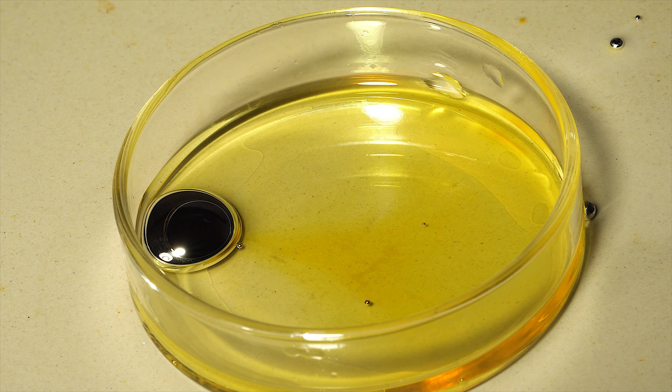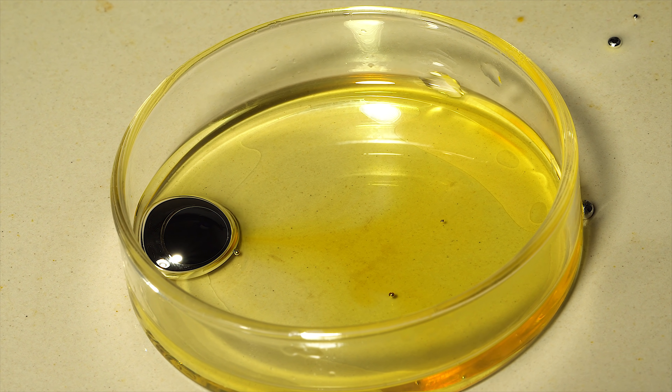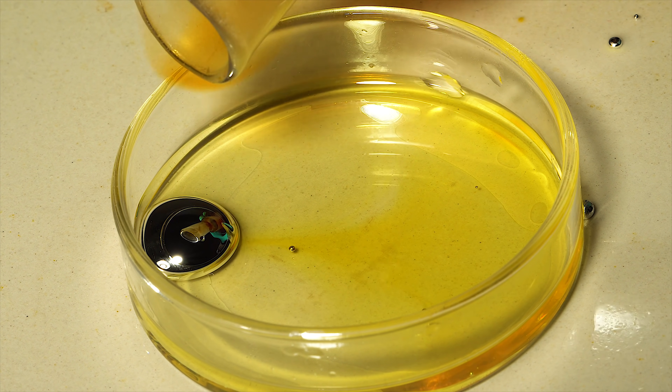A clean gallium surface like this one is very sensitive to bromine vapors. Note how the drop starts to slip away from bromine vapors as soon as I take them closer to its surface.